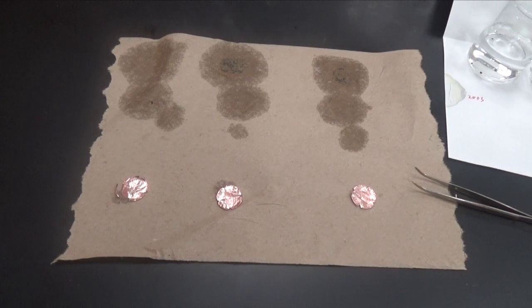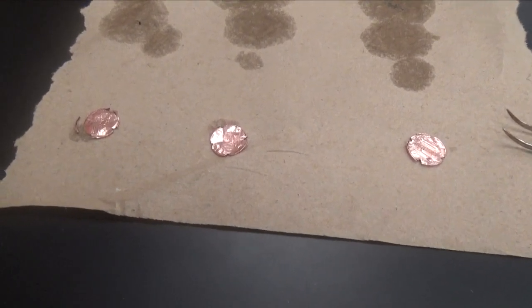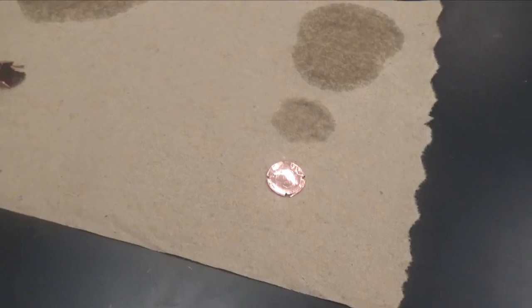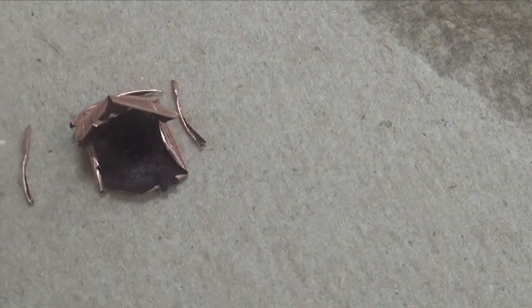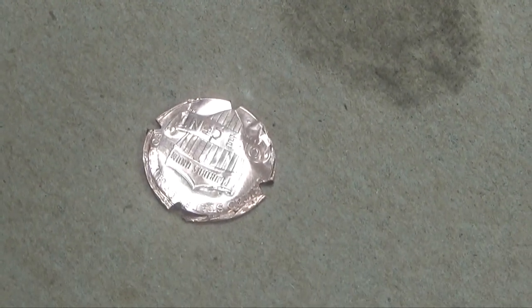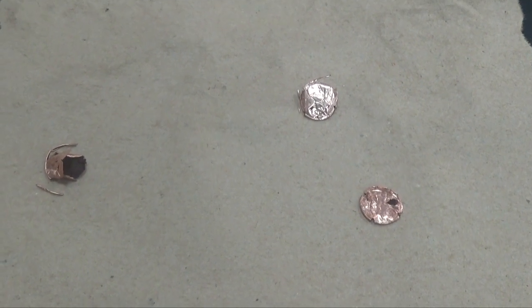As you can see, the pennies have been placed on paper towels, and the pennies now at this point are simply a copper foil. This is from group A. Once again, there's one in the fume hood that's still under acid, but you can see that this one opened up, and what we have here for each of these pennies is basically just a thin copper shell. The inside of a penny is primarily zinc. Okay, the second penny for group A is now done.